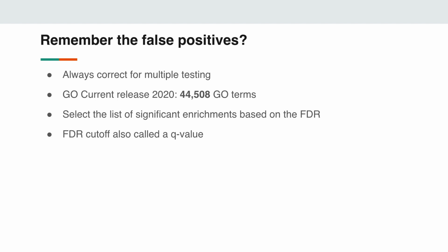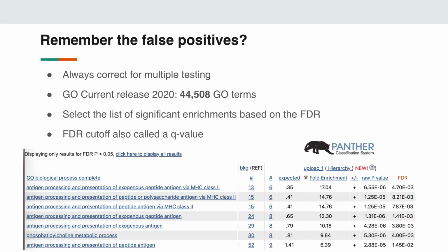This is just to show you an example of gene ontology analysis done through the Panther online tool using the upregulated genes in that example experiment we've been working with.